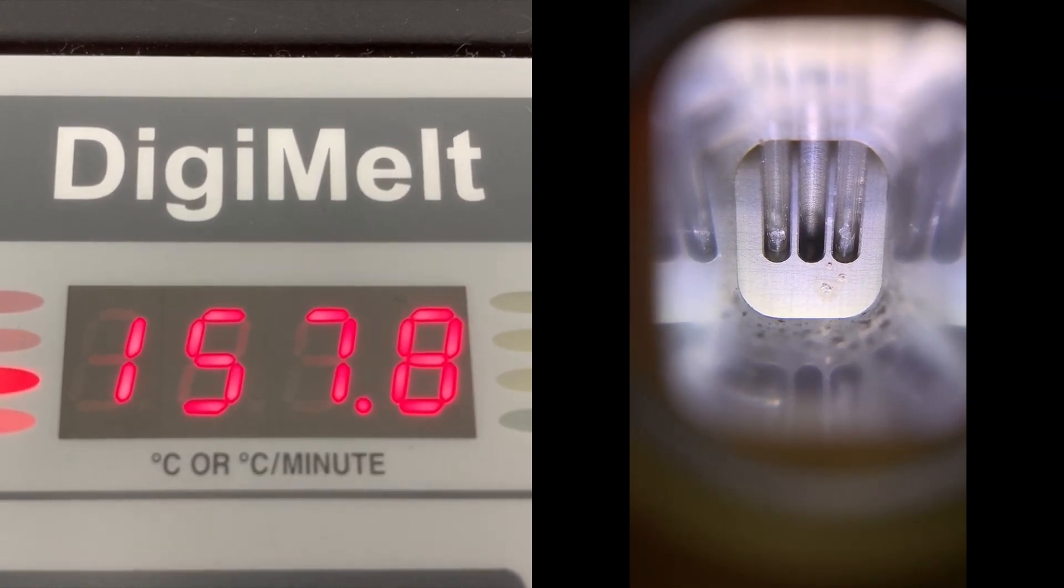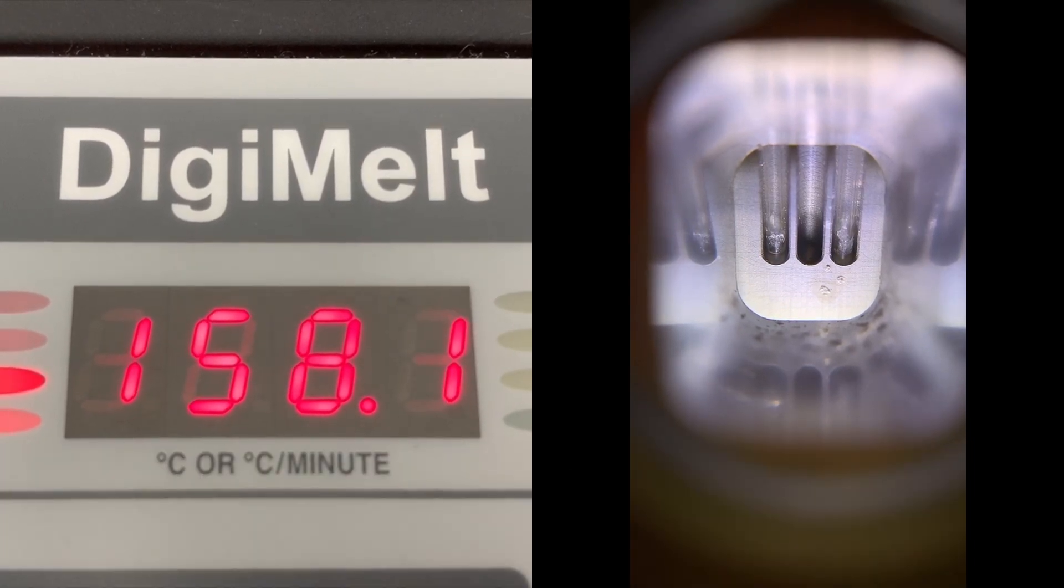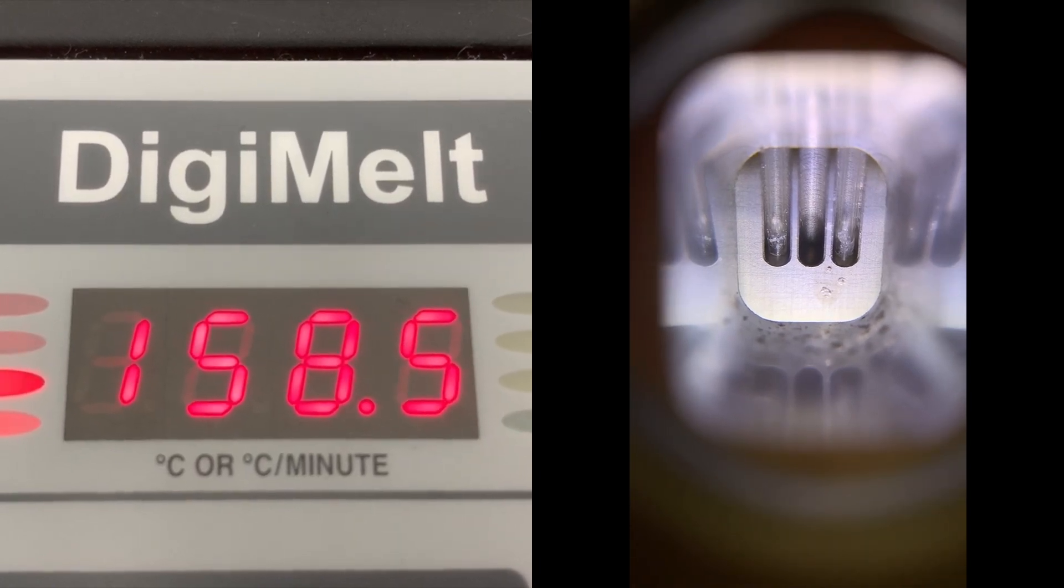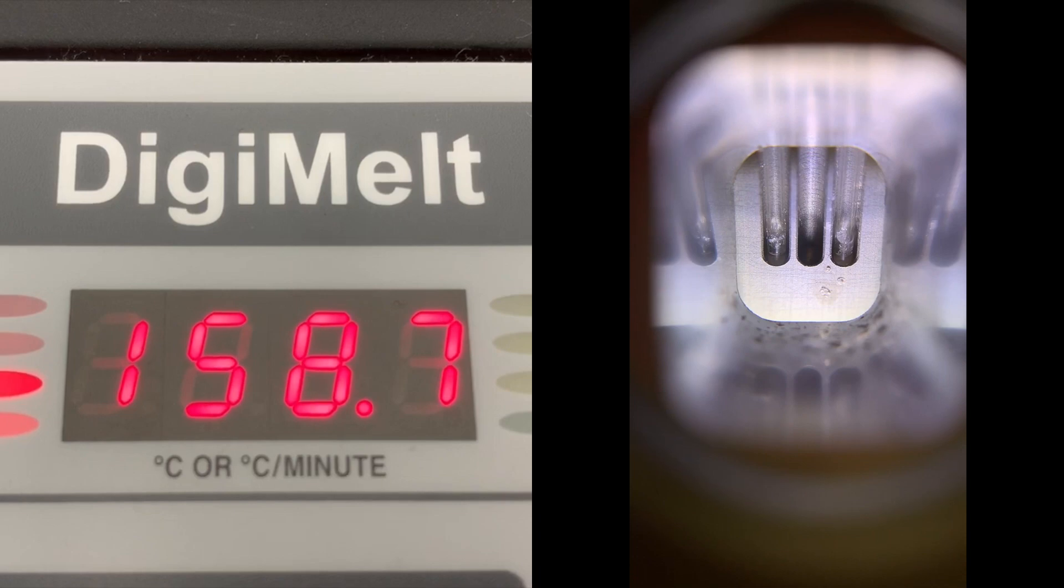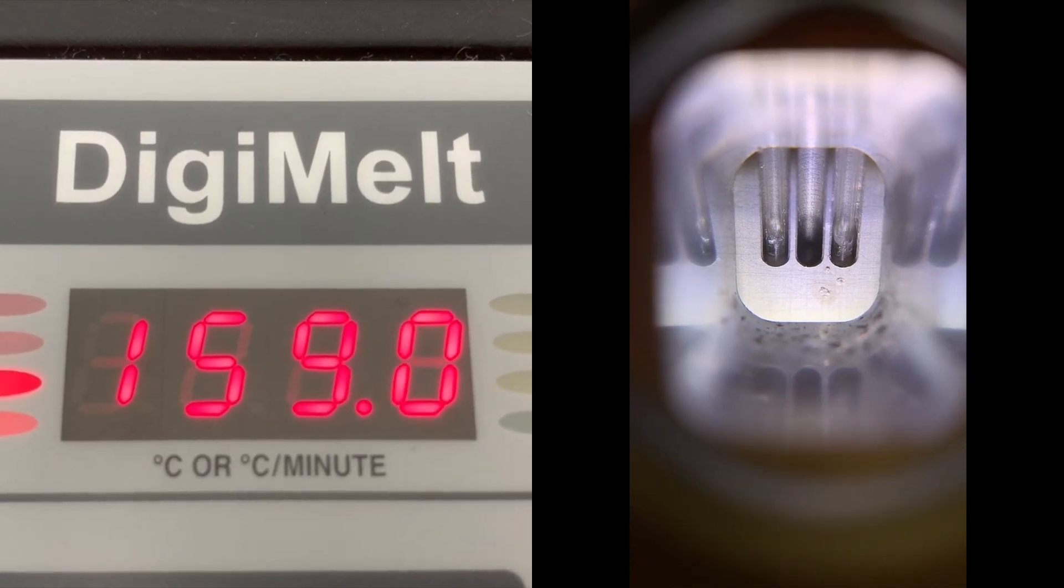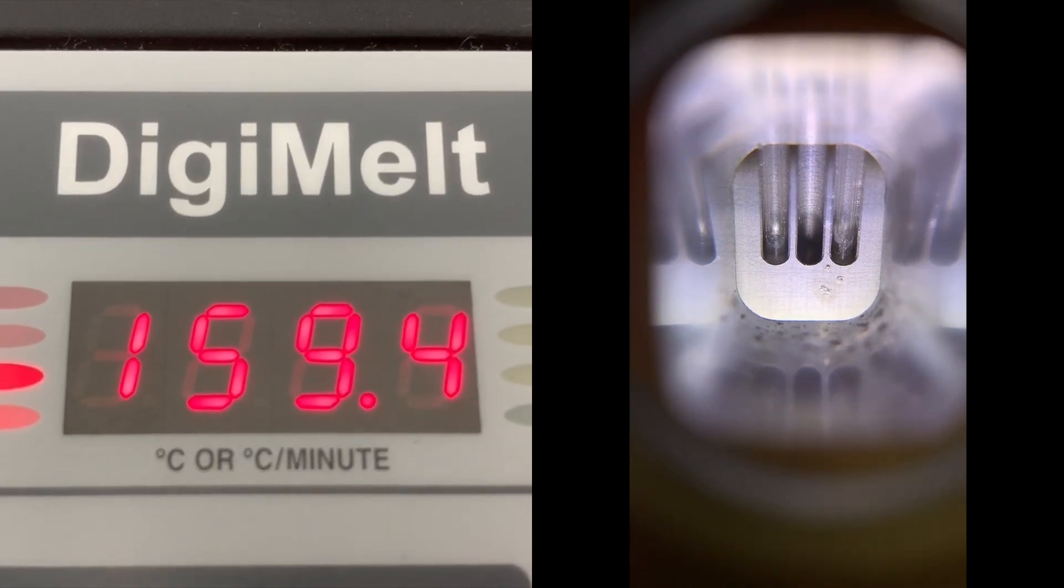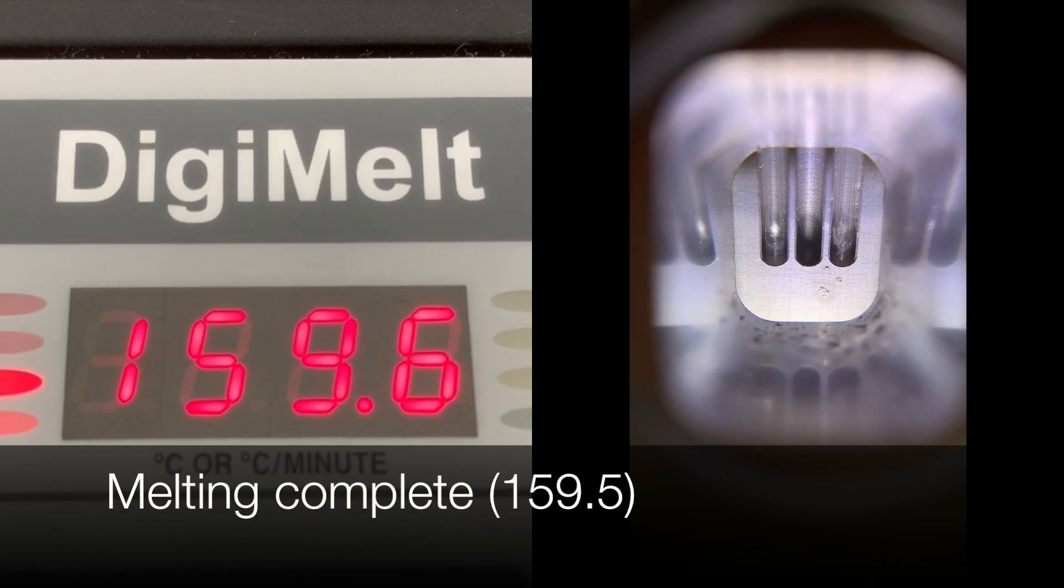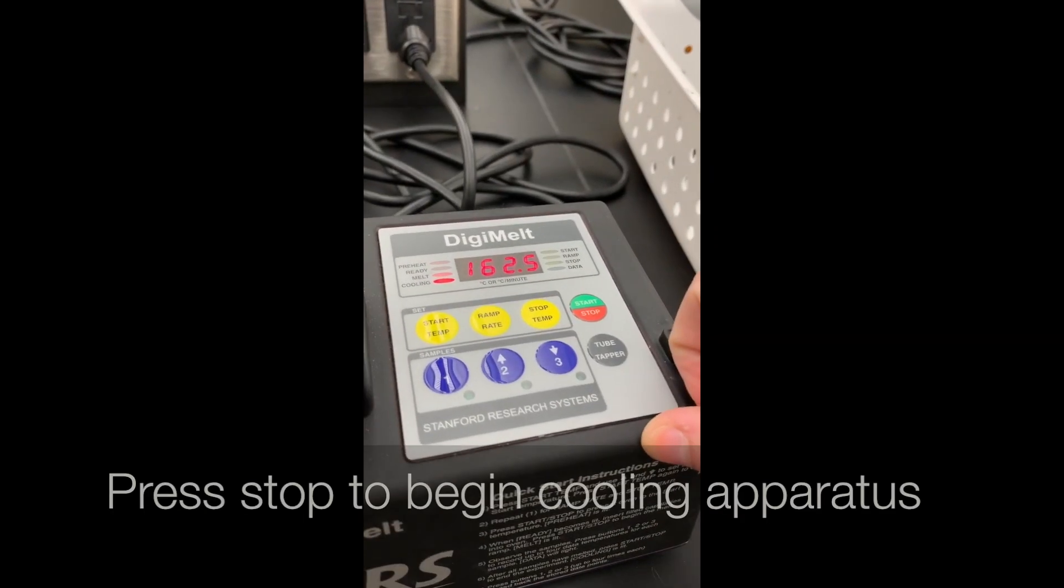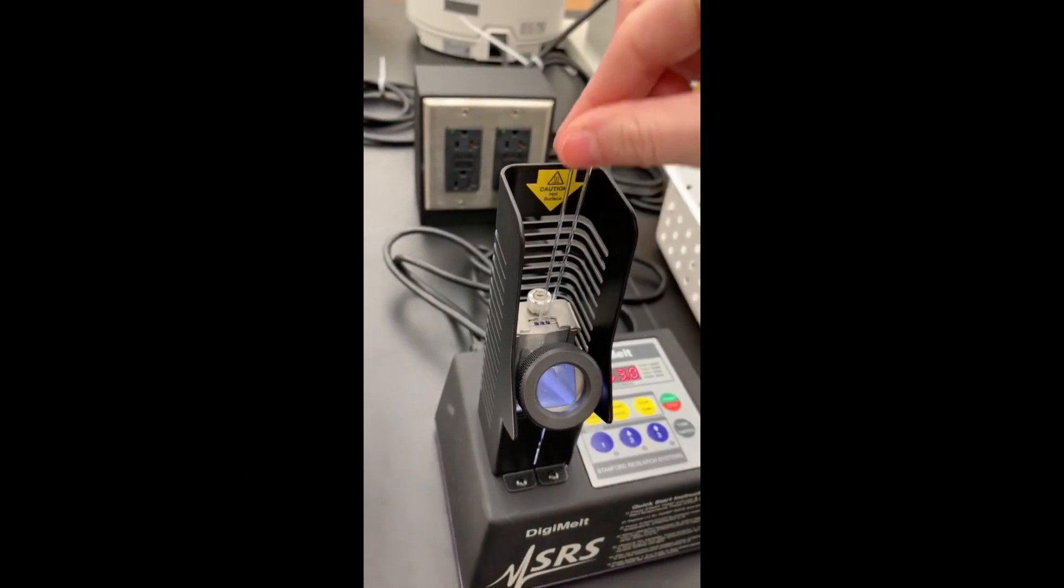Our sample begins to melt at 157.9 degrees Celsius. The sample continues to melt and when it reaches 159.5 degrees Celsius, it is completely melted. Now that it has completely melted, we press stop on the melt temp apparatus to begin cooling it. Then we remove the capillary tubes.